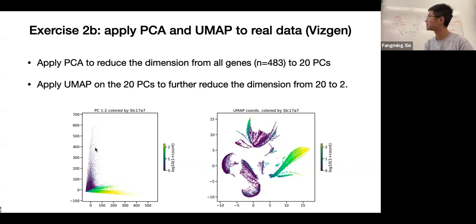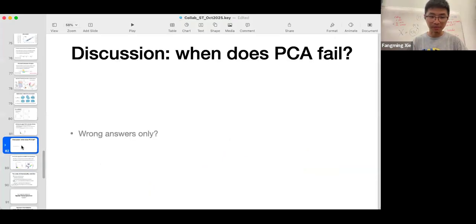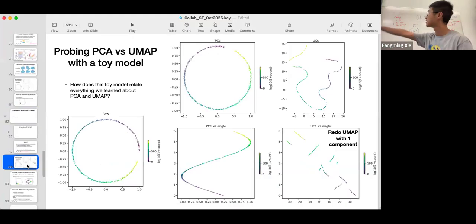But among these branches, there are a few different things that actually separate from each other, and that can be revealed by UMAP. That's why it's powerful. But keep in mind the global structure cannot be trusted, as the example shown here. Points that are polar opposite to each other in PCA will not be preserved, right?